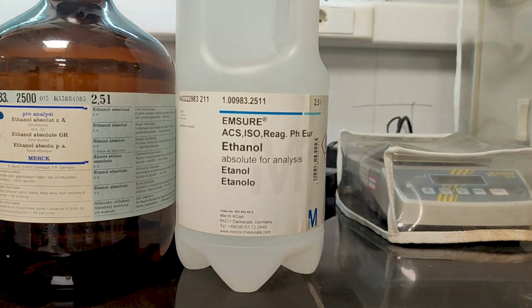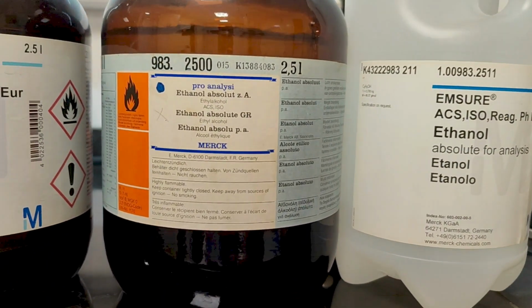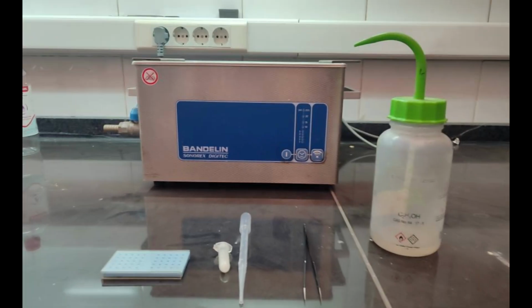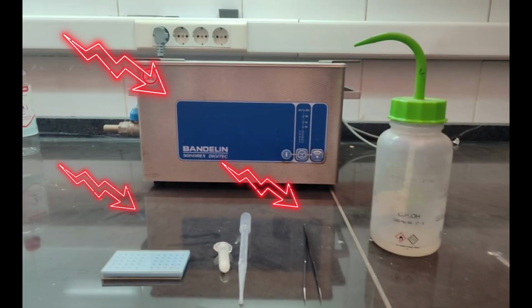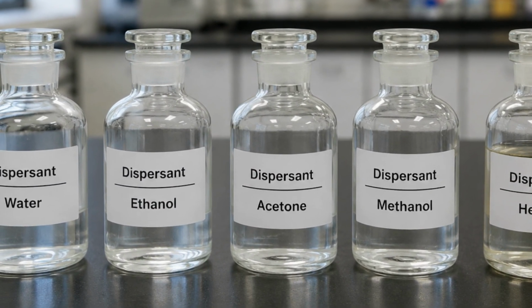To master this process, you will need a few essential laboratory tools: the appropriate dispersant, a suitable TEM grid, an ultrasonic bath, precision tweezers, and high-quality micropipettes. The first critical step is selecting the right dispersant.